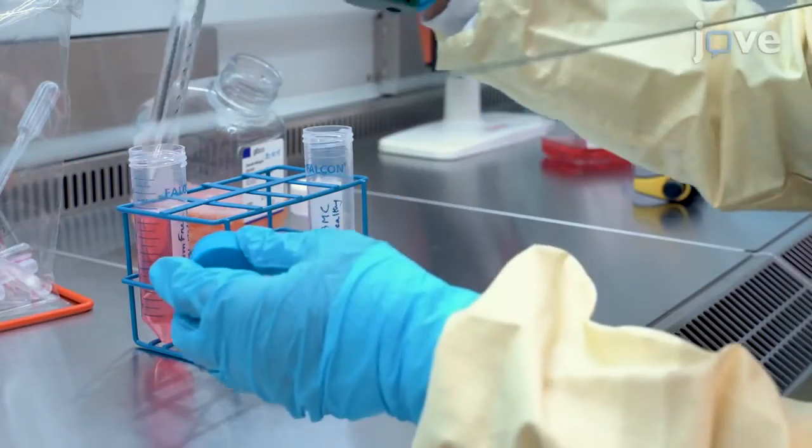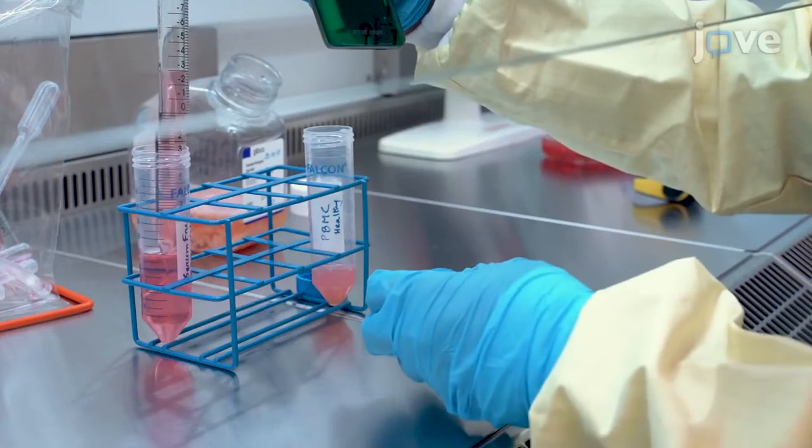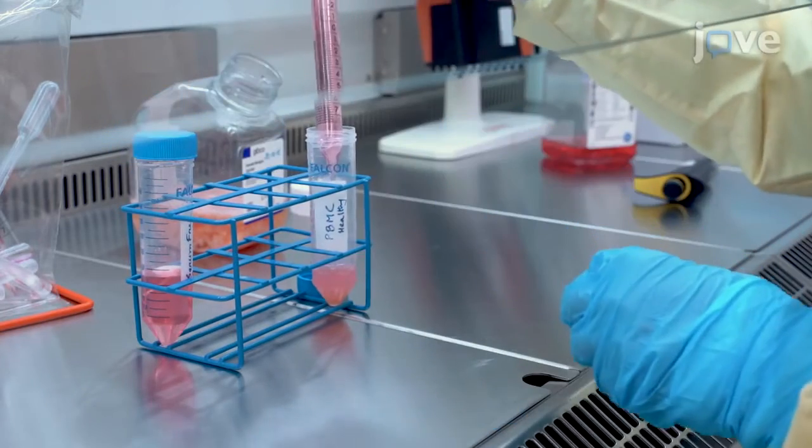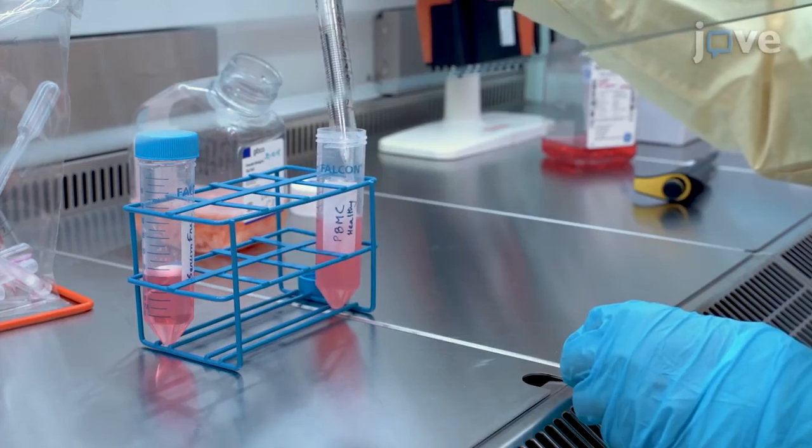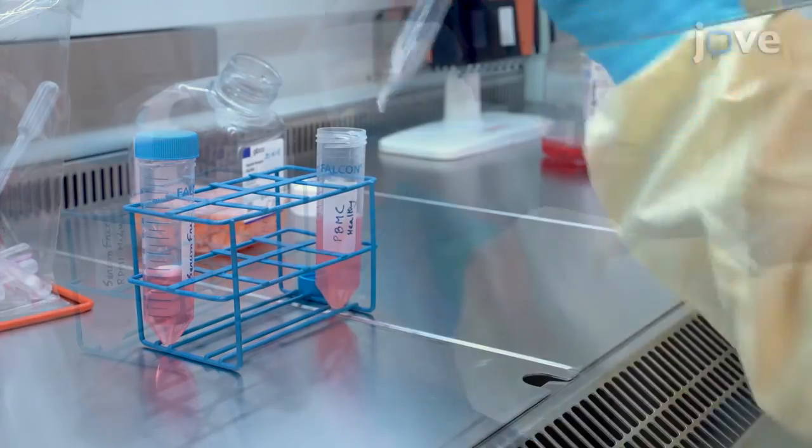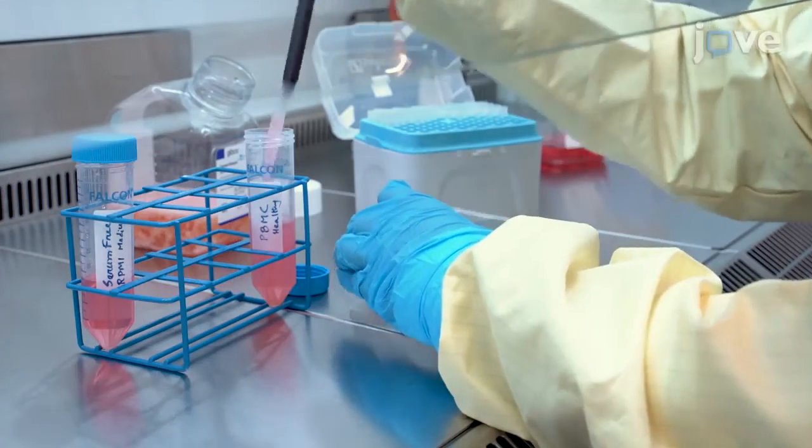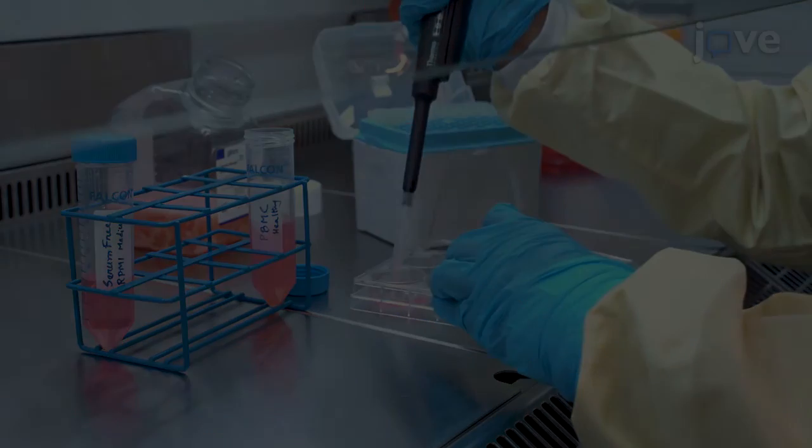To initiate macrophage differentiation, dilute the cells to a 5×10⁶ cells per milliliter of serum-free medium concentration and seed 2 milliliters of cells into individual wells of a 6-well plate.